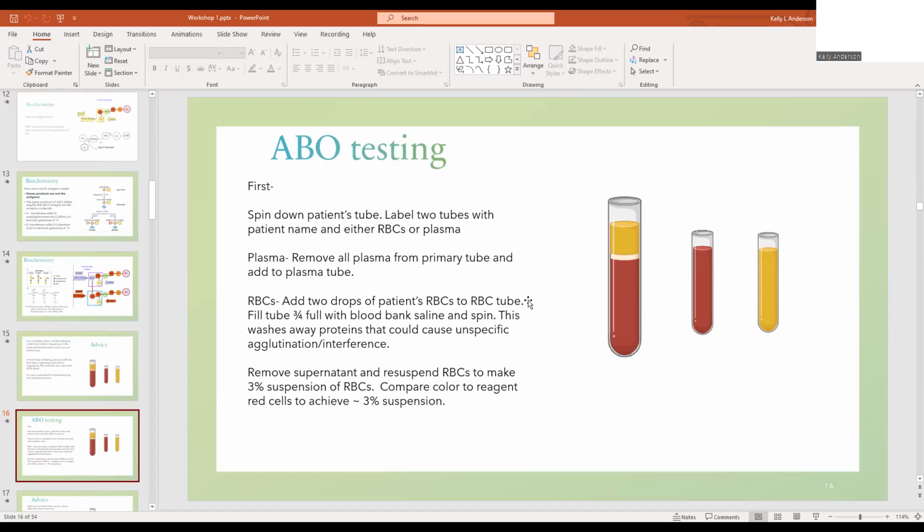So when you get your sample out, you can dump it into the bio bin. That's why you have to spin for 1 minute, so that your cells are packed enough.